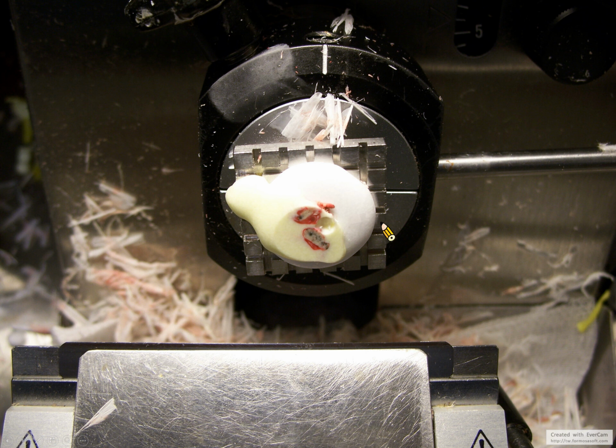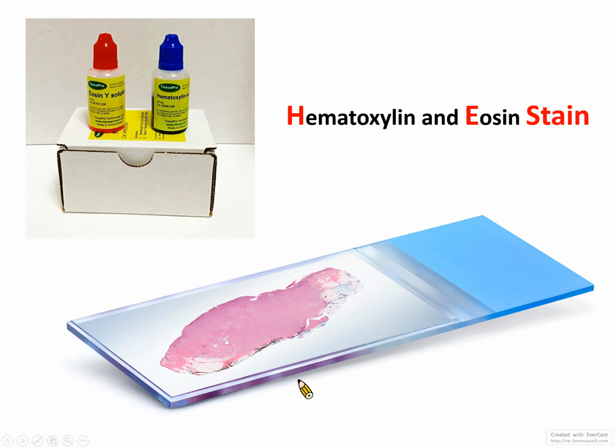These thin layers of tissue drop onto this part, and you can use the glass to attach to this tissue, and you can make a pathology glass slide. So this is one slide of the pathology tissue sample.